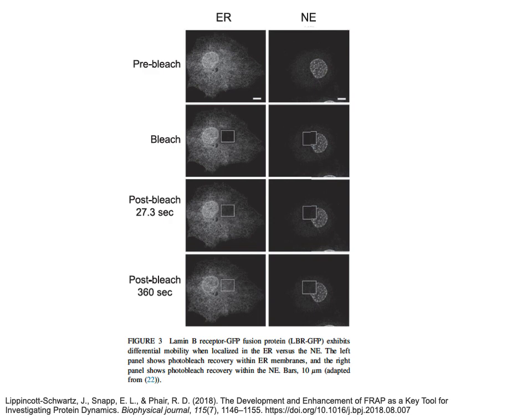So you're not directly even touching the microscope, because the microscopes are so sensitive that they're actually on float tables to minimize any kind of vibrations. The area they're looking at is so small that even slight vibrations, like a truck going by, could cause that microscope to move enough to cause the image to be blurred. And so these setups are not cheap.